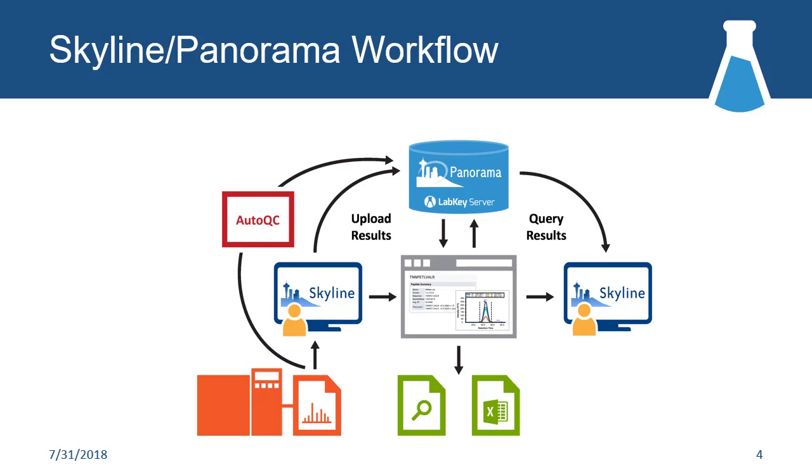And so you have a variety of users interacting with that in the web interface, and this is sometimes a nice way to share data with someone who wants to see some of the detail but doesn't know anything about Skyline. You haven't conned them into coming to the next version of this class. So they can just log in, you just send them a link, and you can always download the file back into Skyline and iterate on it. We always want to have that full fidelity where we're allowing you to get back to the primary data within Skyline.